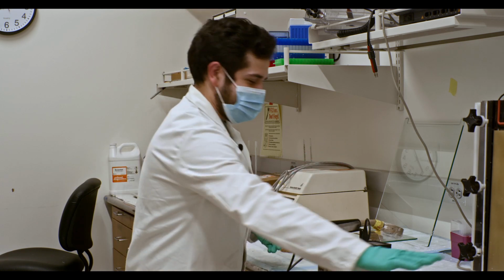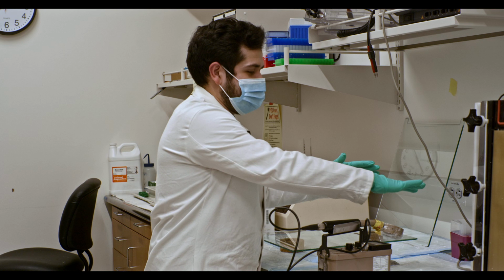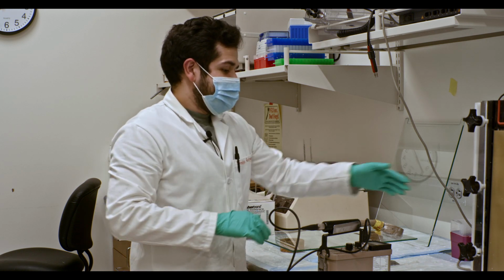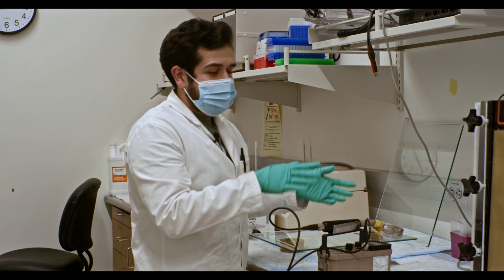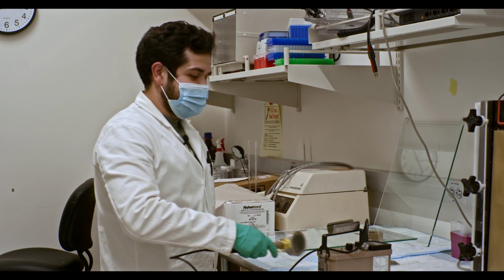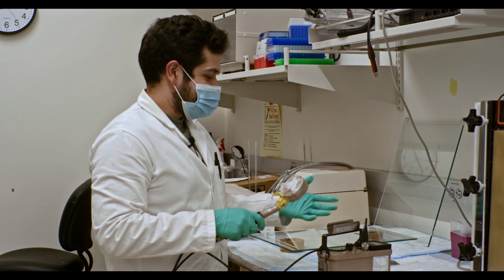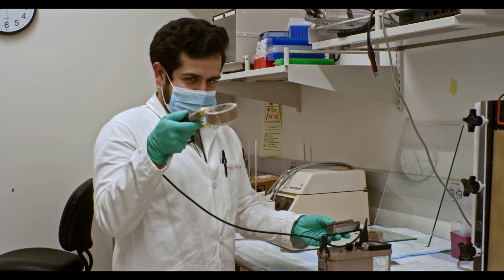So here's the Geiger counter that I was talking about. Before you ever handle it, make sure that you do a swishing movement of your hands above the Geiger counter reader to make sure that you don't have any radioactive material. From those little chirps you heard, I don't have any radioactive material. When you should worry is when you hear a sound like that. That means that you have radioactive material that has fallen down either on your hands or on your clothes. Of course, if you point the detector straight up into the ceiling, sometimes the instrument will freak out.